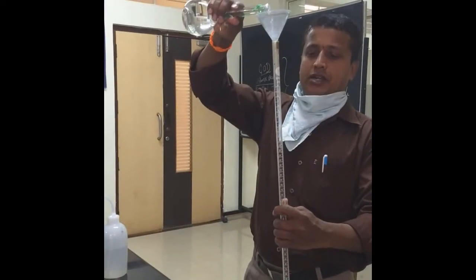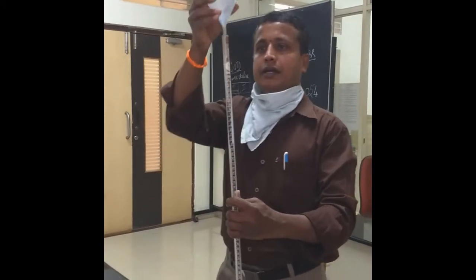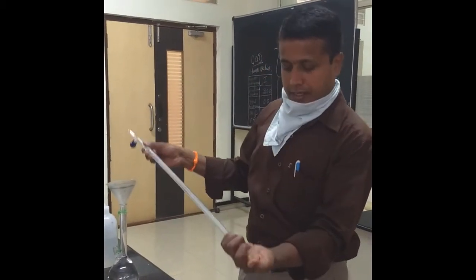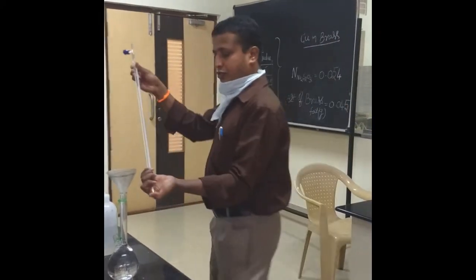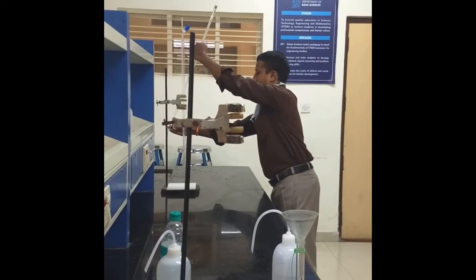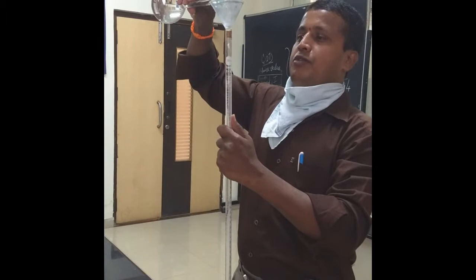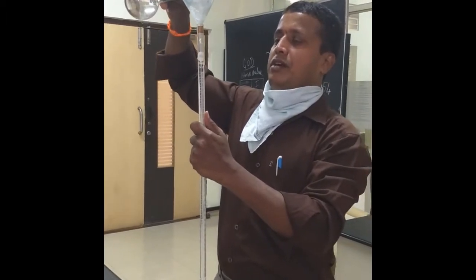Now, this prepared standard solution is used to rinse the burette. Like this, the burette needs to be rinsed, and the rinse solution is to be rejected into the sink. Now again, this burette is to be filled with the prepared standard solution of disodium salt of EDTA.